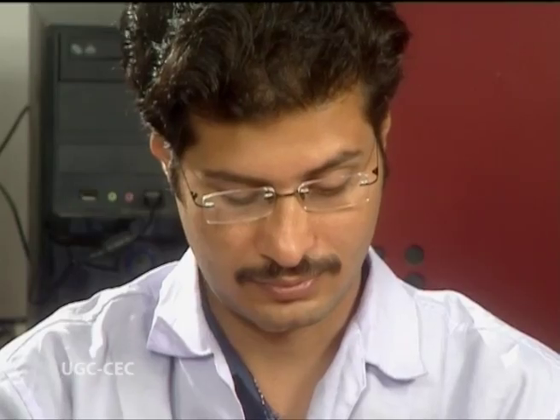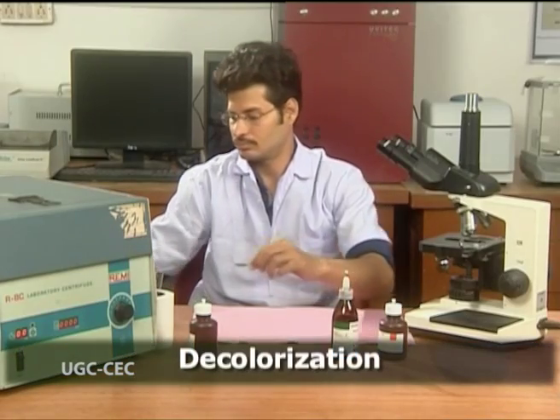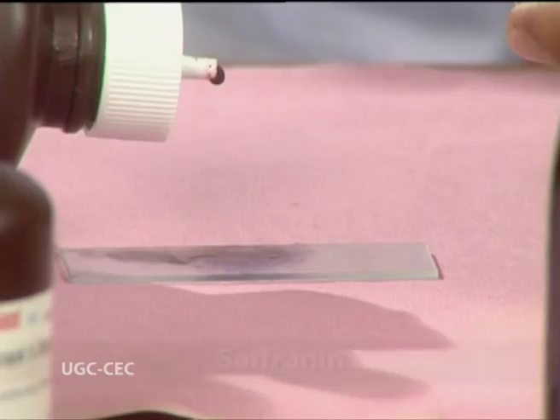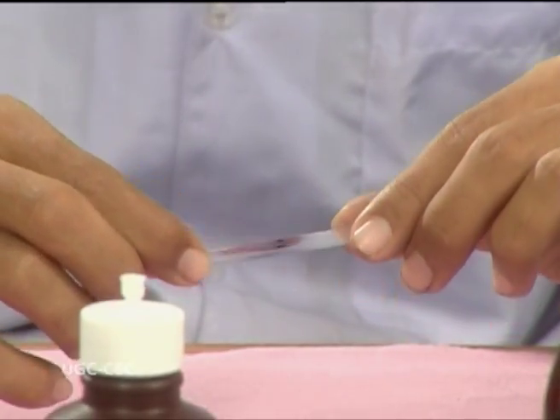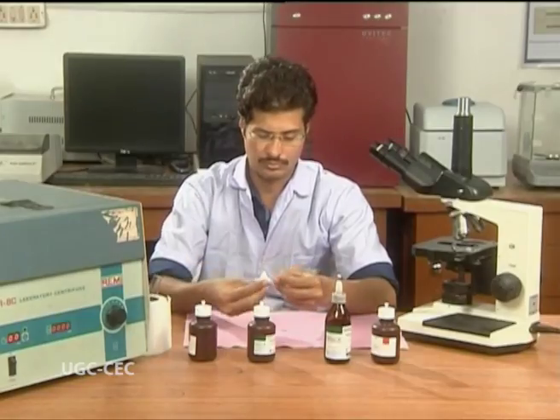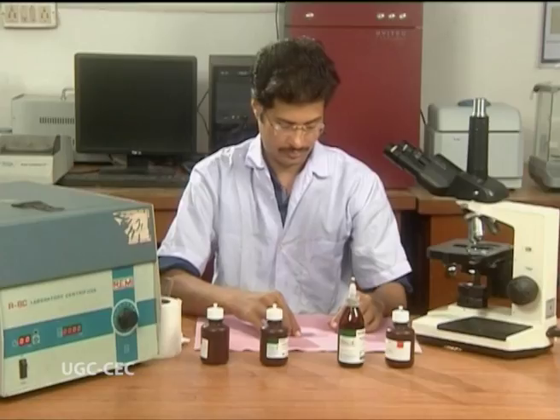Stain it with Gram's stain and observe under the microscope.